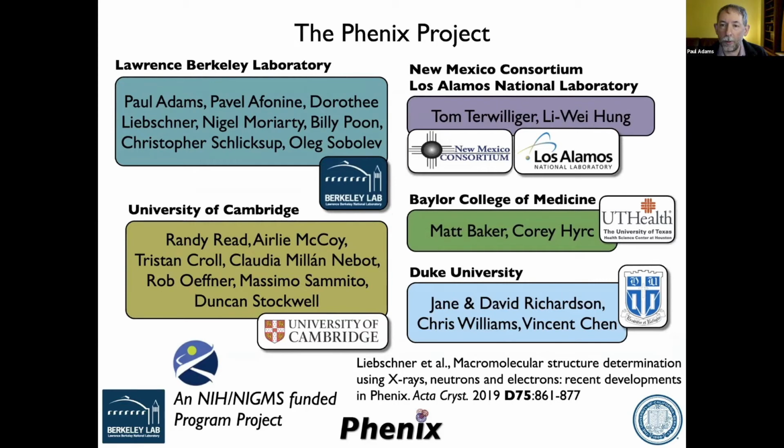So when it comes to creating or simulating a map from an atomic model to compare with an actual cryo-EM map, yes, we have a number of tools, and Phenix.F model is one of them. So you need to use appropriate scattering factors, which are electron scattering factors.